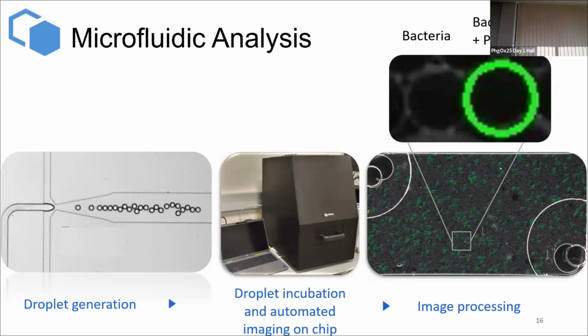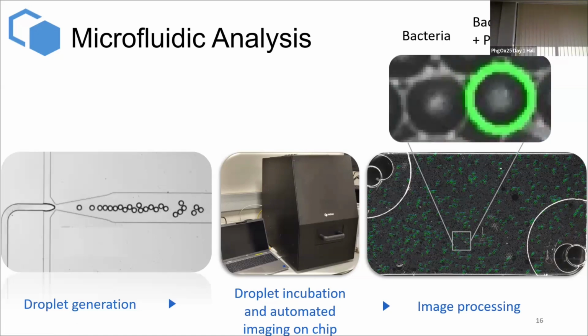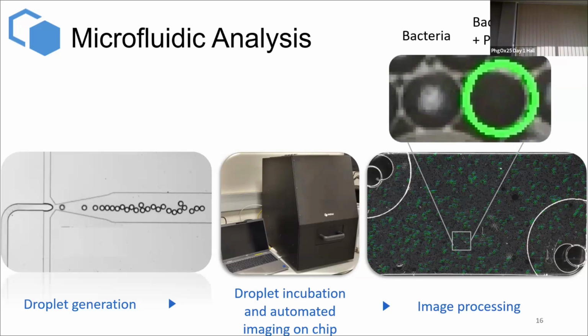And I just cut out of this range 2 droplets, 1 droplet with bacteria in, and 1 droplet with bacteria and 1 phage. And I'll try to show what happens as a function of time. Both droplets start growing, and after a while, the population in here disappears because of the phage, which destroys the living bacteria. So you really look into one cloned phage, which does destroy that population in that drop.